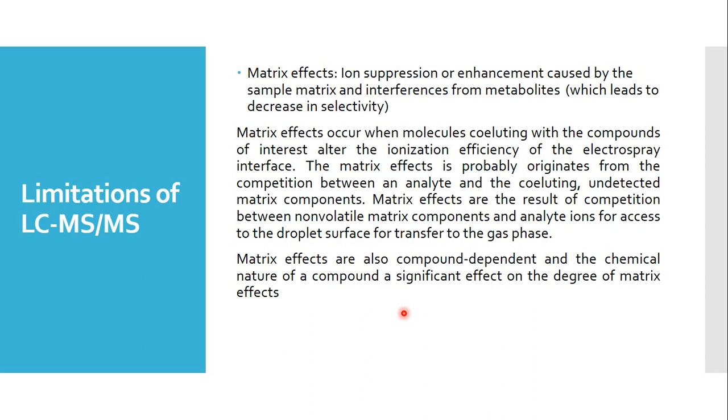Okay, now let us see the limitations of LC-MS/MS. So first limitation is matrix effect. Due to matrix effect, ion suppression or enhancement can occur, which is caused by the sample matrix and interferences from the metabolites, which leads to decrease in selectivity. Matrix effect occurs when molecules coeluting with the compound of interest alter the ionization efficiency of the electrospray interface.